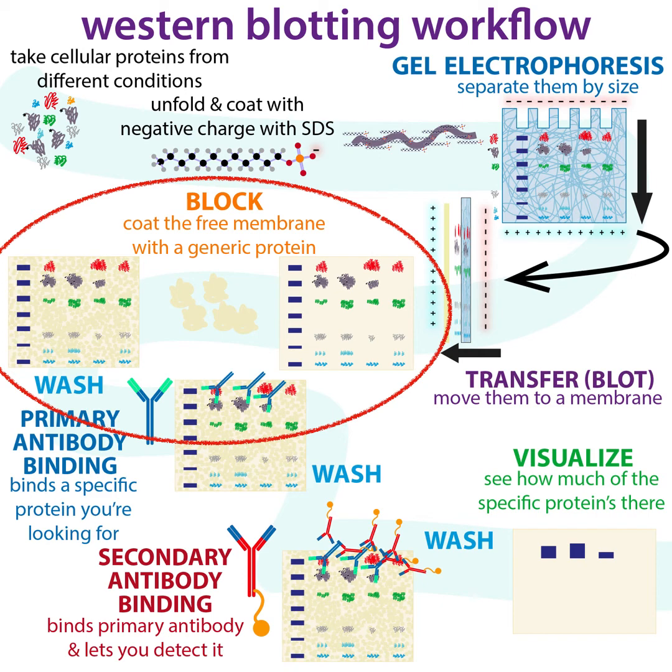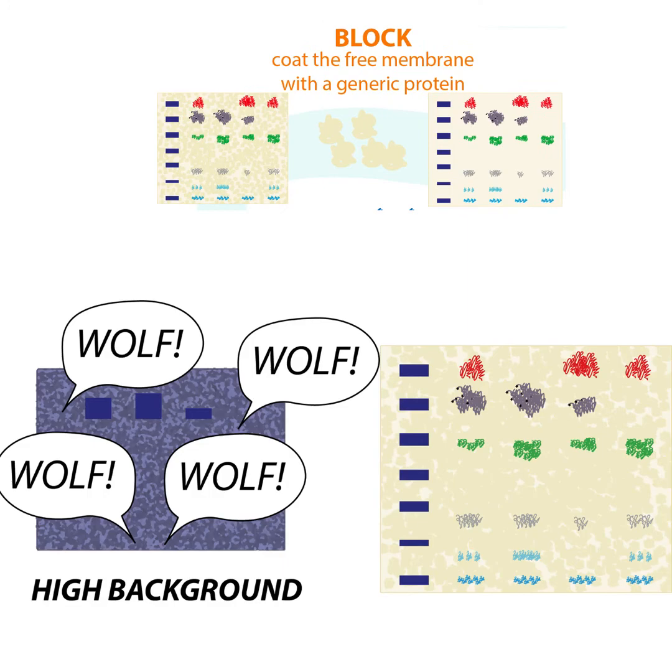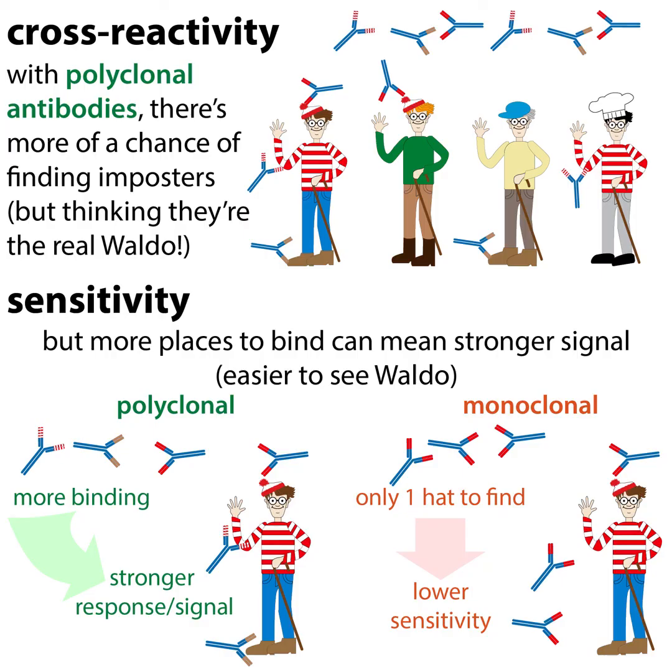Like if the membrane's really slippery, the antibodies aren't just going to bind randomly. Or that's the hope, at least. And then you also have all those wash steps, so that if they do bind, they'll get washed away. The wash steps are like the worst part of all of this, because it's really time consuming and boring, because you keep having to wash and wash and wash. But it's important to wash, or else you get high background. So that's the basic idea of that.